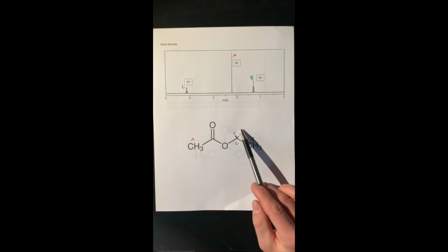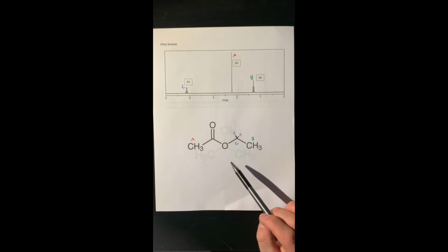And as we know by now, the electronegative elements pull signals downfield. So the triplet shown at 1.3 ppm here belongs to the CH3 hydrogens on the end of the chain, the furthest away from the ester. So this will undergo first order coupling with this CH2 right here, these two hydrogens, and that's why it has a triplet, because these three hydrogens are coupling with these two equivalent hydrogens.